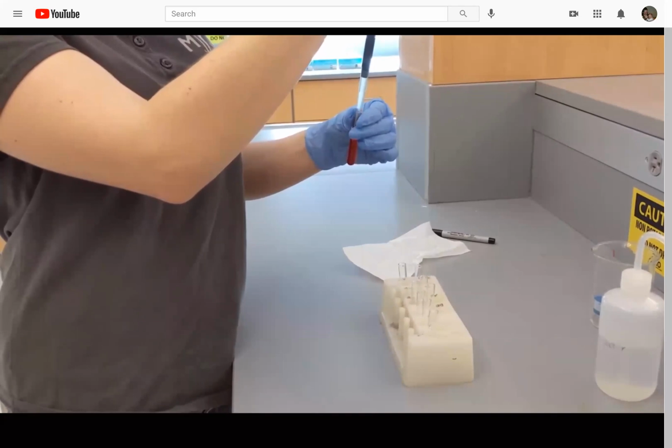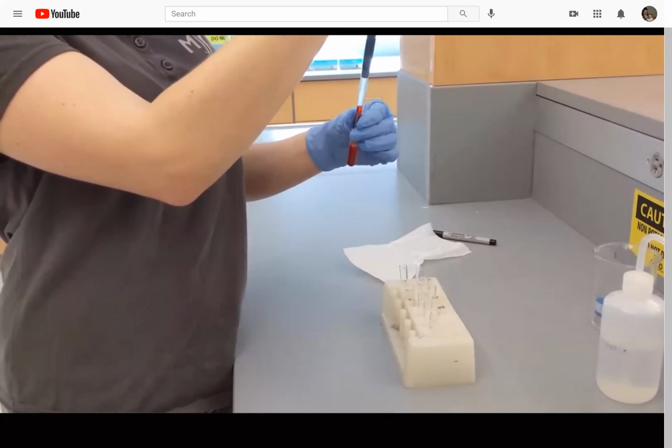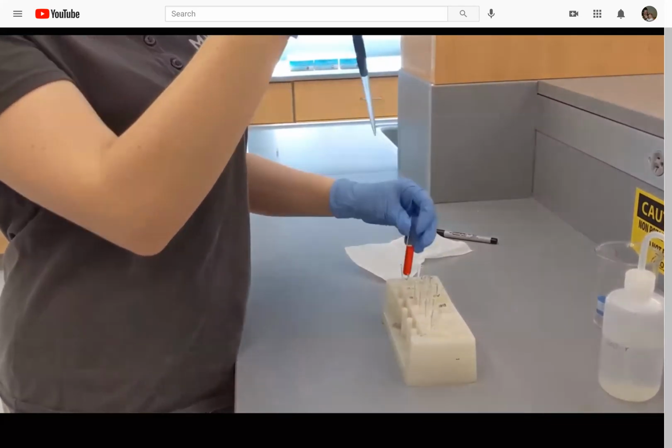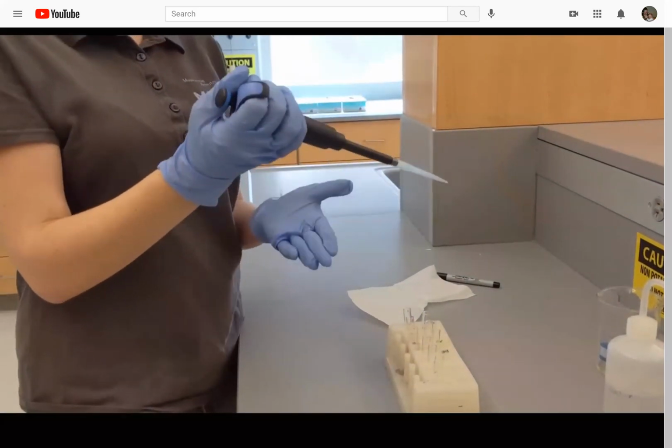Make sure this is thoroughly mixed. I'm then going to discard my pipette tip and get a new one for my next dilution.